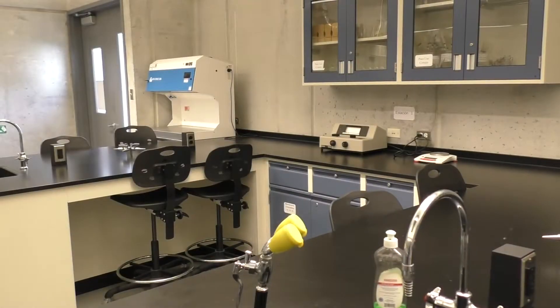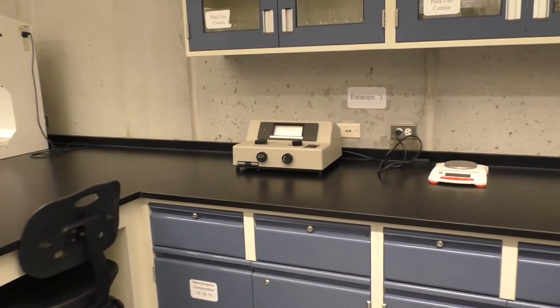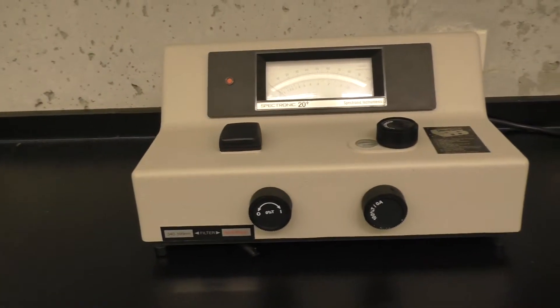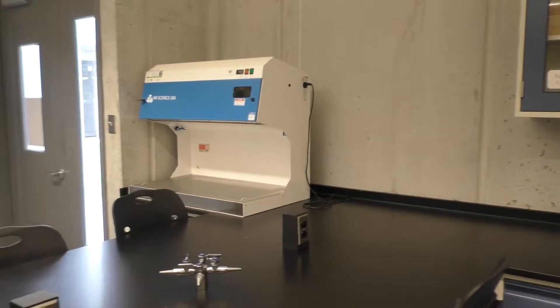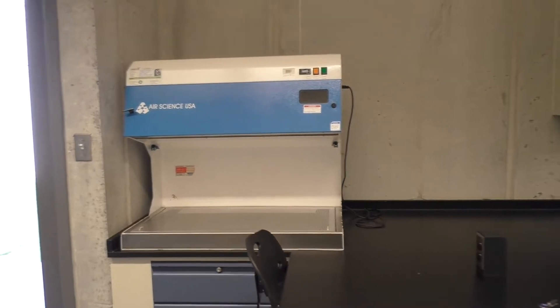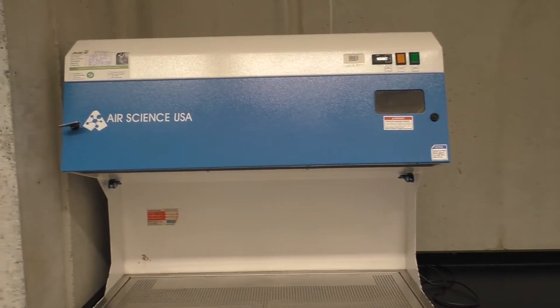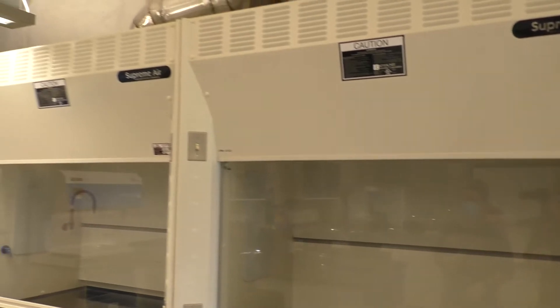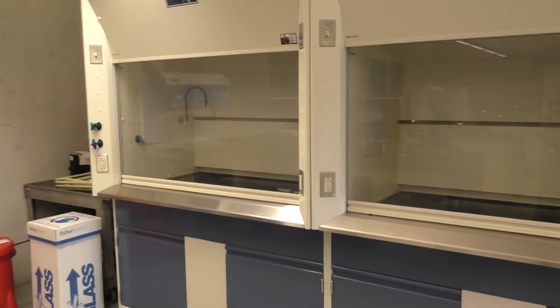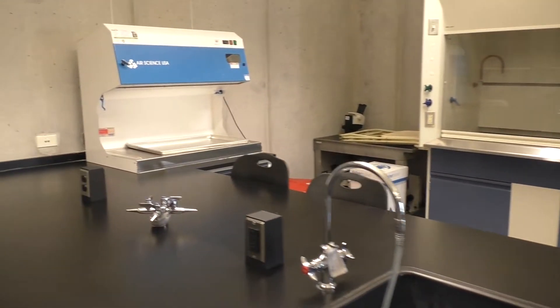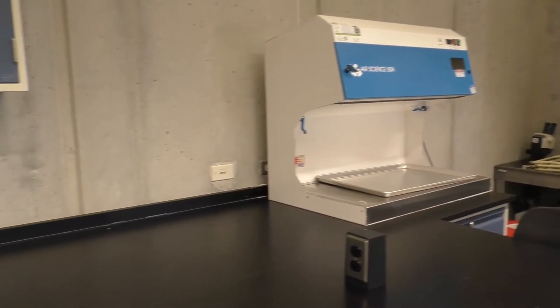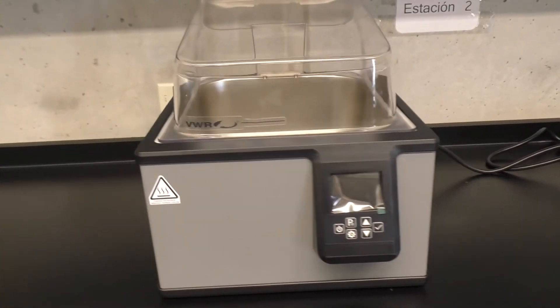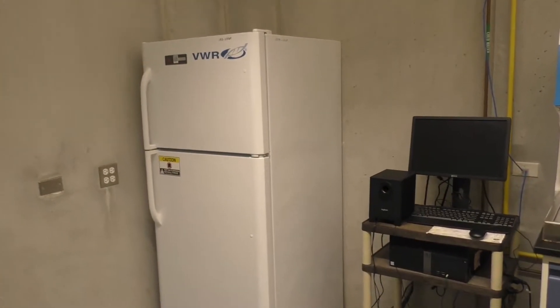The general lab equipment includes a spectrophotometer, four ductless fume hoods, two conventional fume hoods, digital hot plates, and a water bath. And of course, we also have a refrigerator.